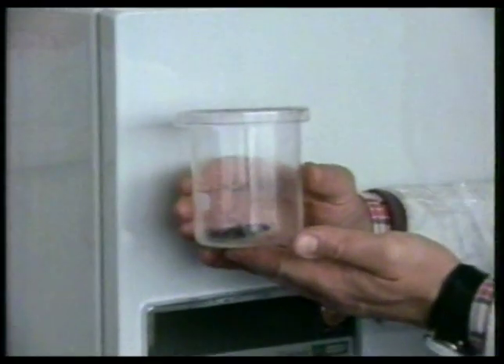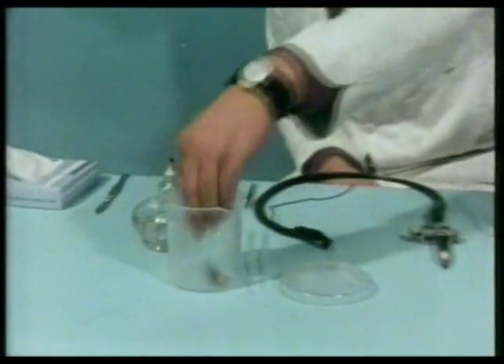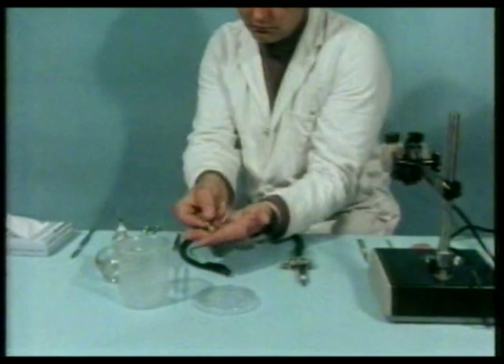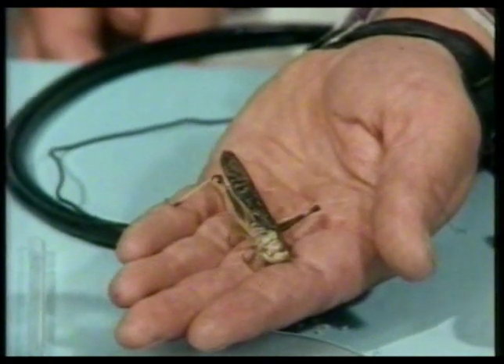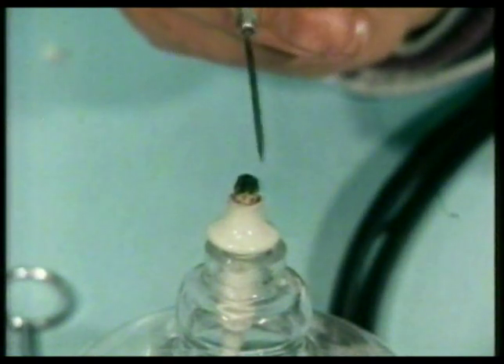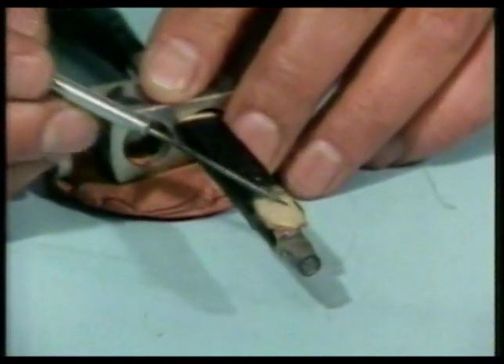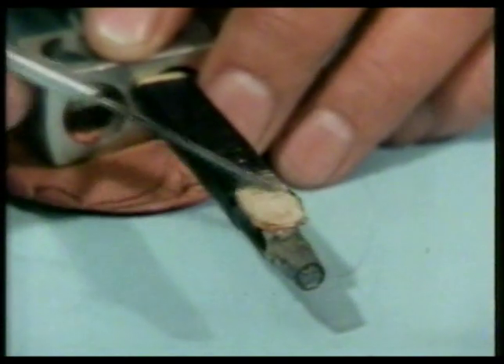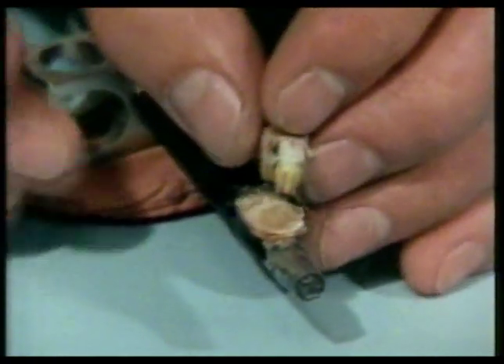A large female locust is chilled in a refrigerator so that its activity is slowed down but it isn't killed. A mount is prepared on which the insect can be held in position for the experiment with its ventral surface uppermost. It's stuck down using melted beeswax. Its legs are removed before it's put in position.